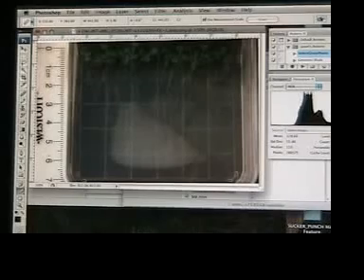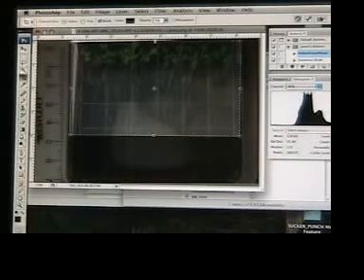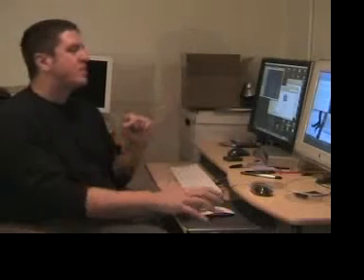Next, use your crop tool to remove the extraneous image area. Essentially, you can get rid of as much as you want to, as long as you don't crop out any of the green sample matter that you want counted, and as long as you leave at least one complete reference square visible. You'll need the reference square for the next step.